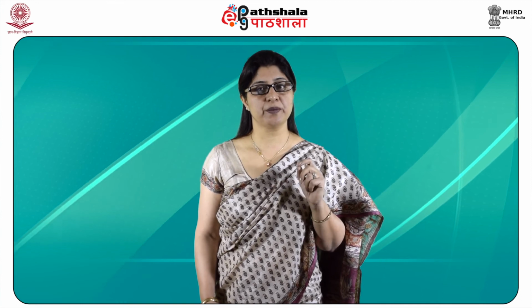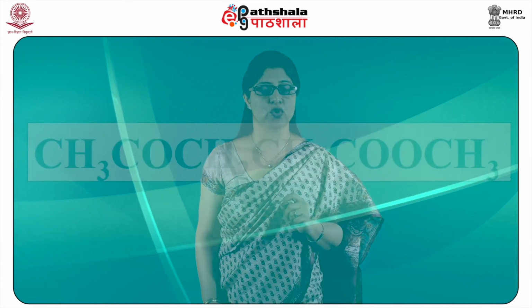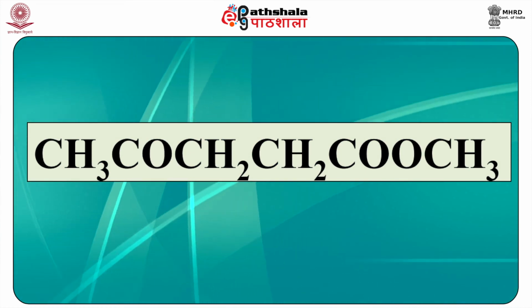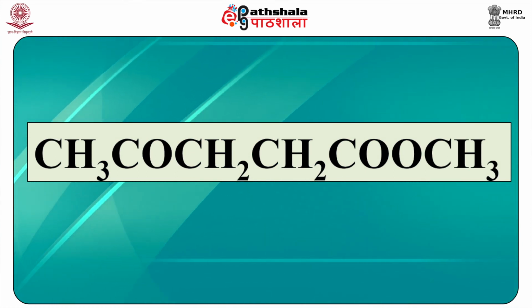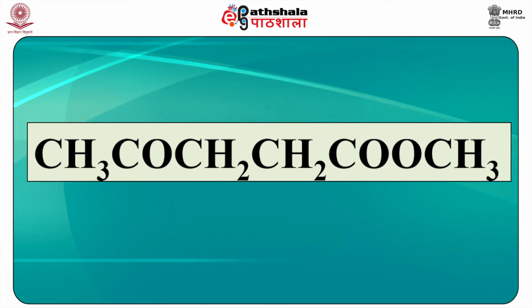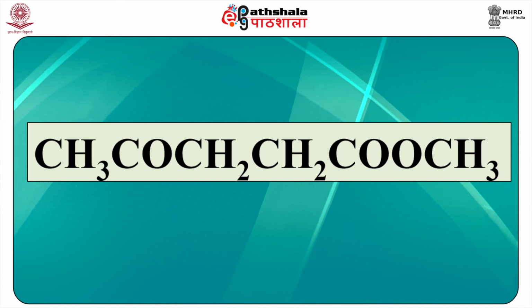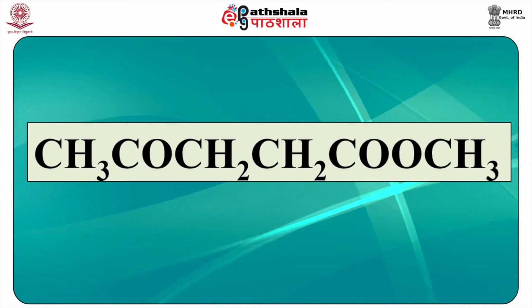Further, the presence of peaks at 170 ppm and 200 ppm indicates the presence of a carbonyl function. So, looking into all these above parameters, we can conclude the correct structure for the compound to be CH3, CO, CH2, CH2, C double bond O, O, CH3.